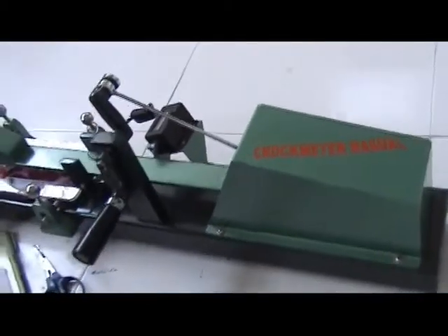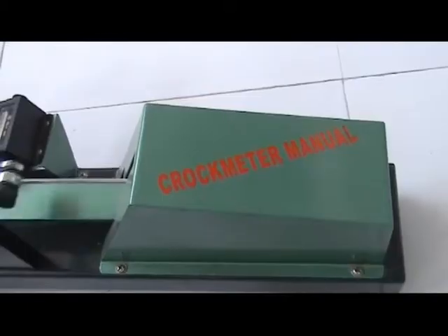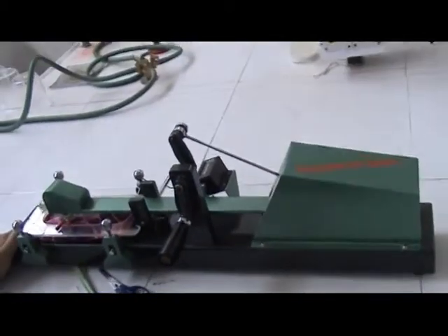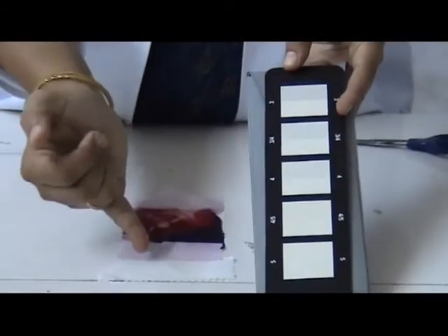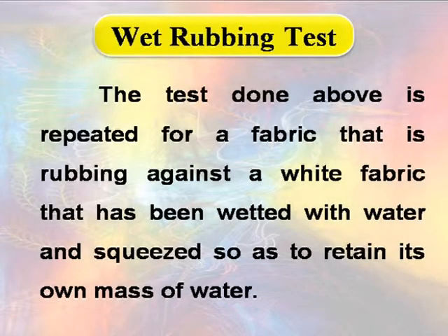The test sample is rubbed 10 times to and fro in a straight line along a track 10 centimeters long on the dry specimen. The amount of color transferred due to dry rubbing is assessed by comparing it with the gray scale for evaluating staining.